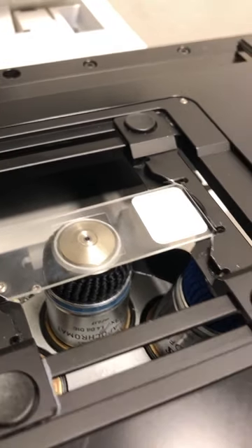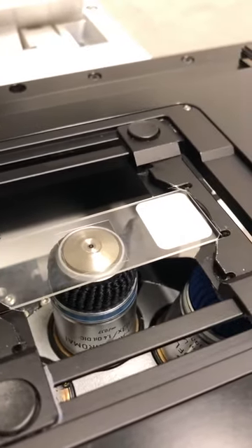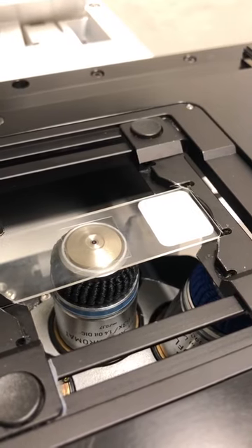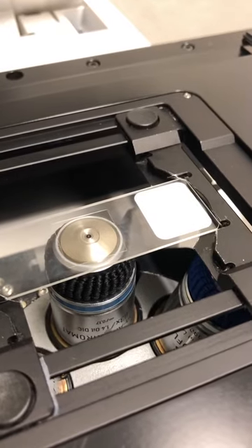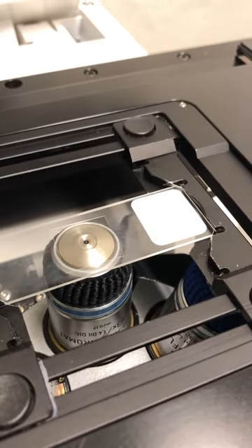Just move a little bit down, because you want to be below your sample when trying to focus — that way you know that moving away from you means you'll run into your sample. I'll focus by eye and we'll return to the confocal software once that's done.